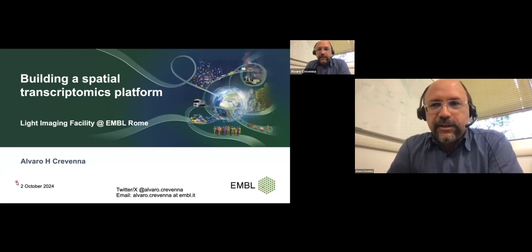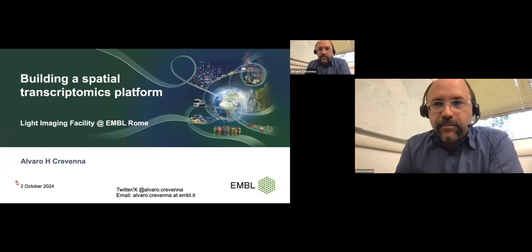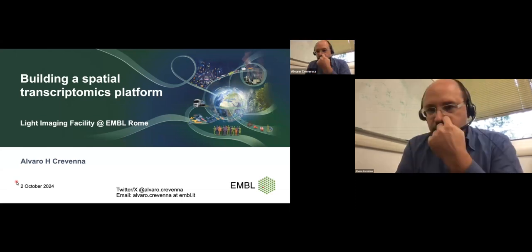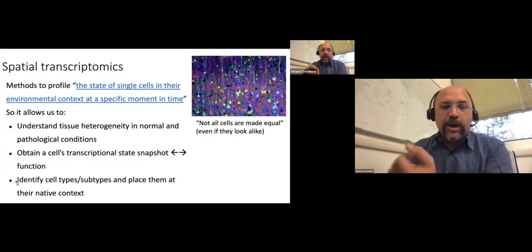So what I will be telling you is our experience in trying to build a transcriptomics platform. I'm the current head of facility at EMBL Rome. We lead a microscopy facility, so I will obviously be talking about imaging-based methods. We want to build a spatial transcriptomics platform, but for those of you who might be interested, just a slide into why we want to do that.